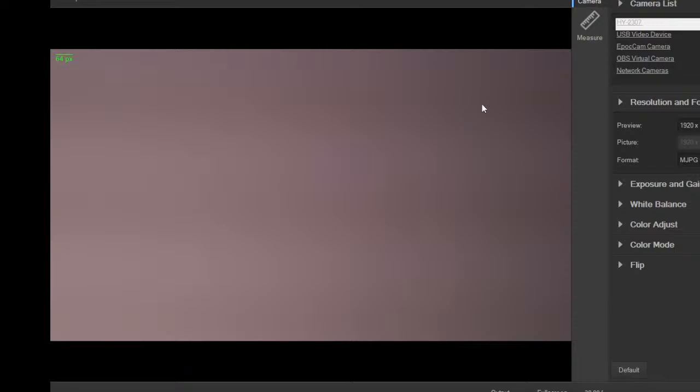And there you go. It's a bit more viscous too, so there's a little bit more stuff going on at the lower power. This is low power. You see all kinds of stuff there. The camera's frozen again. Come on, man. There we go.